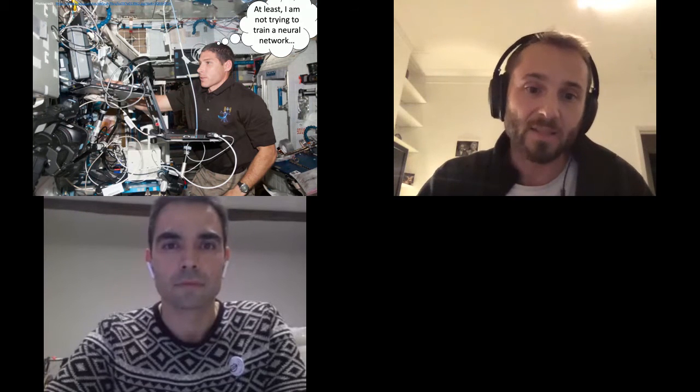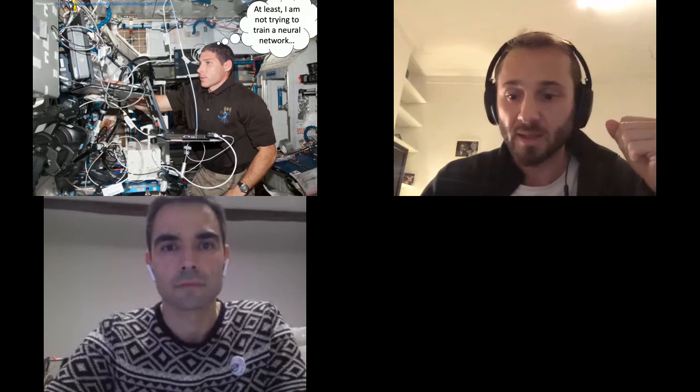So it can feel like this because it requires a lot of expertise, handling a lot of libraries, combinations of libraries, installation, as well as handling hardware and software compatibility. And so what we intended to do with our work with ZeroCostDL4Mic is to really streamline the capability of using lots of different neural networks easily and make it completely accessible to anyone from the biosciences.